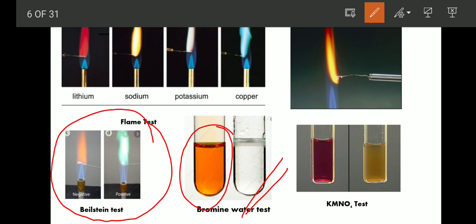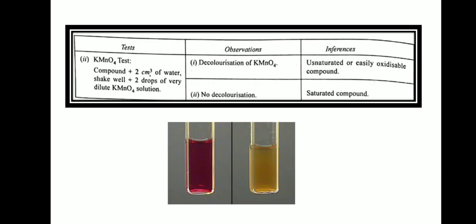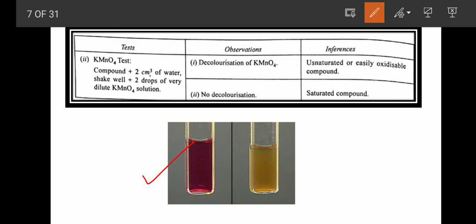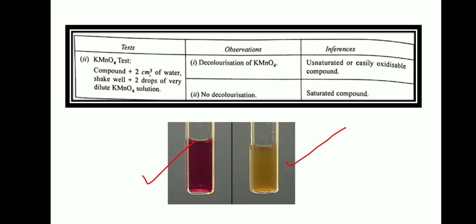One more test to detect unsaturation is the KMnO4 test. KMnO4 is a purple-colored solution. To perform this test, take the compound in a test tube, add 2 ml of water, shake it well, and add 2 drops of dilute KMnO4. If the color of the KMnO4 decolorizes, it means an unsaturated compound is present. If no decolorization occurs, this indicates a saturated compound. In the second test tube shown, the color of KMnO4 decolorizes, meaning the compound is unsaturated.